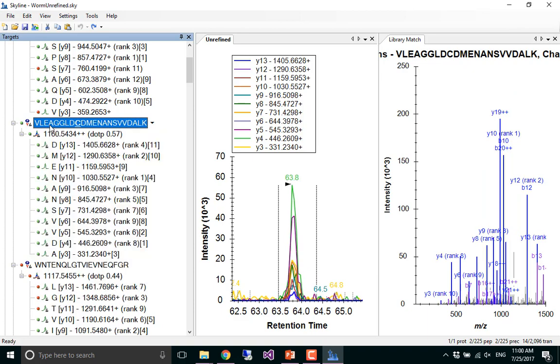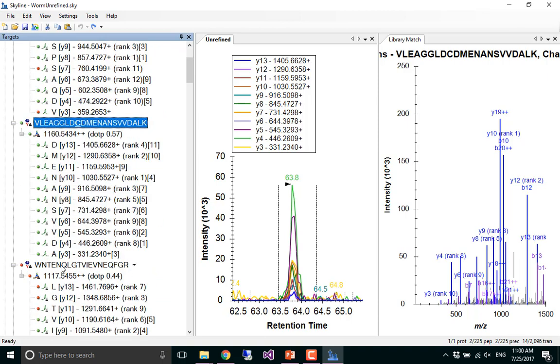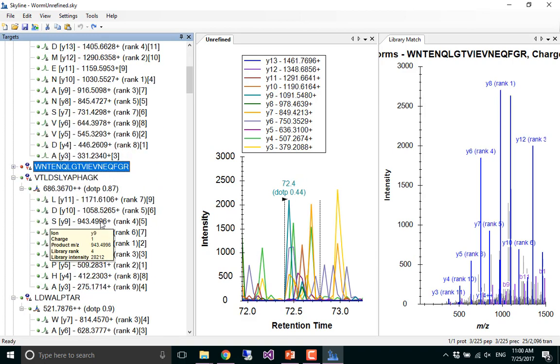Oh, wow, it is a pretty good peak. And I can expect that if I'm seeing orange at the peptide level or red at the peptide level, chances are it's not very good. So that's why it was designed that way. Yeah. So again, it's going to use zeros on those reds.